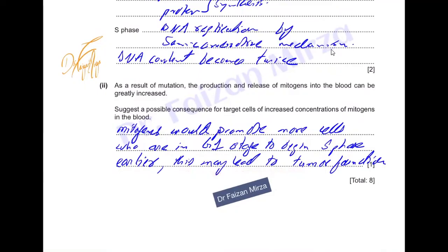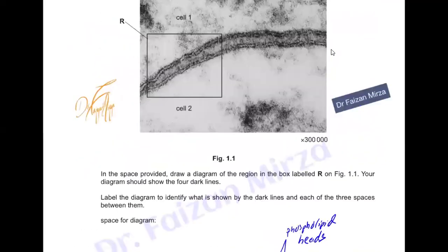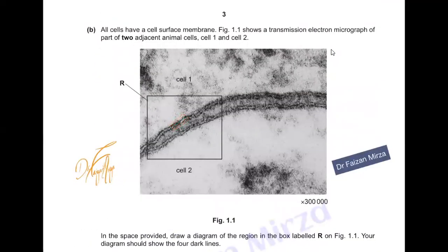So basically, I had to cover how the diagrams need to be drawn and how to interpret these diagrams where gray lines are shown to you. Most of the diagrams will always come from a grayscale image. You need to know how to interpret that and redraw or label it accordingly.